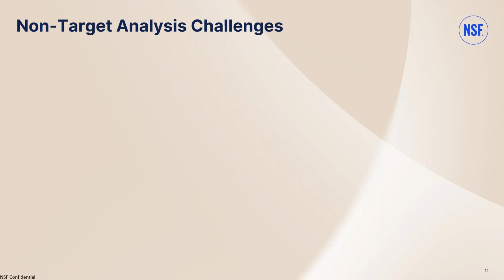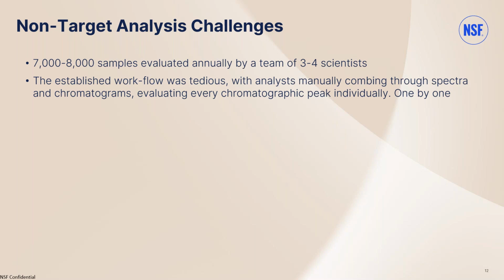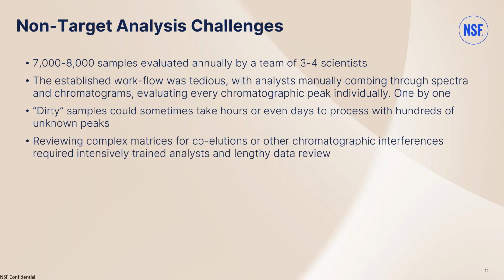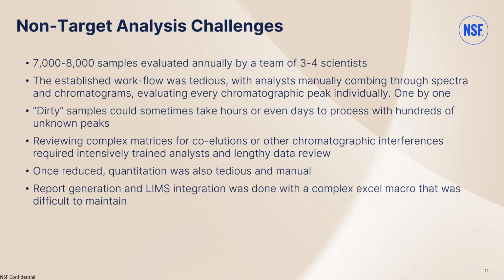Going back to the non-target analysis, I can talk a little bit more about some of the challenges we were facing. Every year we had 7,000 to 8,000 samples that had to be evaluated by a very small number of scientists. Everything about the process was manual. And sometimes some of the samples with more complex matrices could even take days or longer to evaluate. And even after identifying and quantifying all the peaks that were found in the sample, the review was tedious and manual as well.